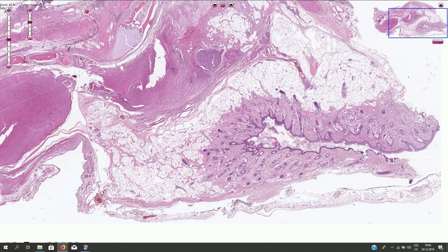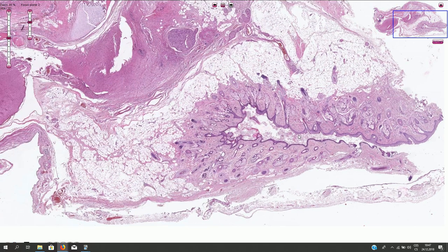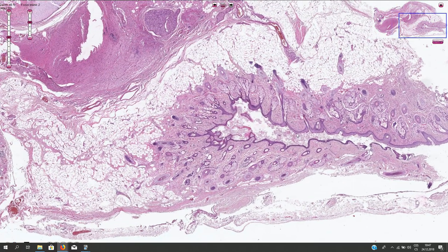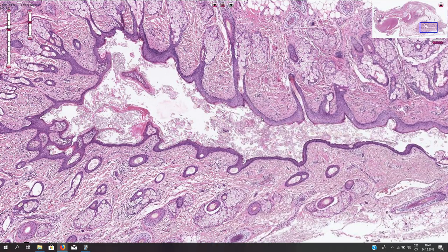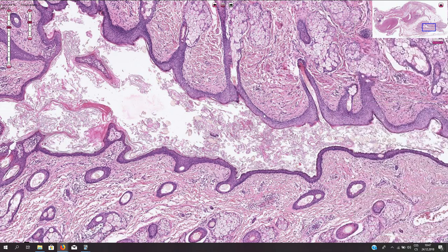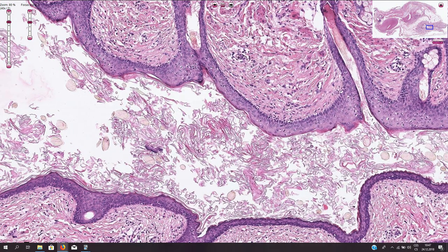Skin is very commonly present in the mature teratoma. Sometimes we can find only skin with skin appendages, in which case this tumor can be called the dermoid cyst. It is usually a cystic tumor filled with keratinaceous debris. If we zoom in here we can recognize the normal epidermis, or keratinized stratified squamous epithelium, with the basal layer, stratum spinosum, and keratinization. The cystic space is filled with keratinaceous debris and hair.